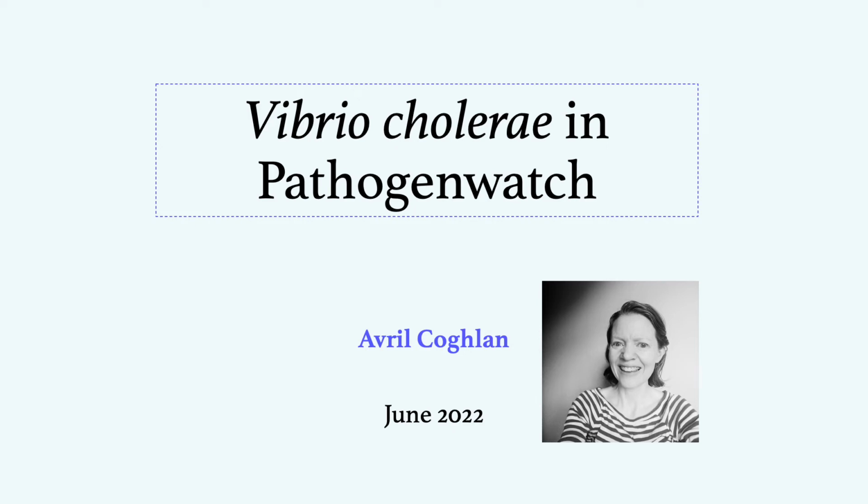Hello, my name is Avril Coghlan. I am a bioinformatician in the Sanger Institute in Nick Thompson's group, and I am going to tell you about Vibrio cholerae genomic data and how you can analyse it using the Pathogen.watch website.